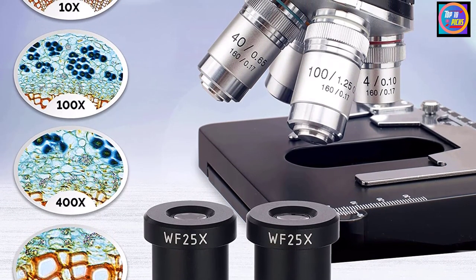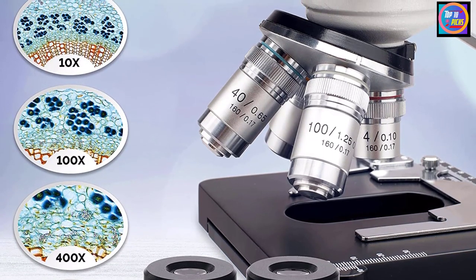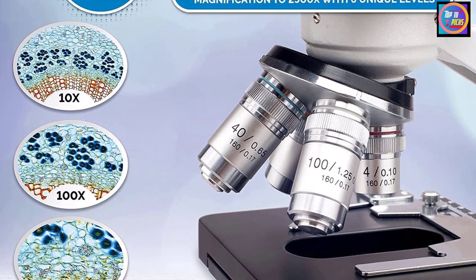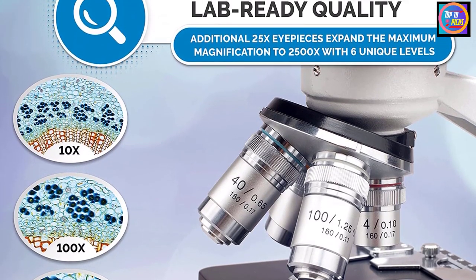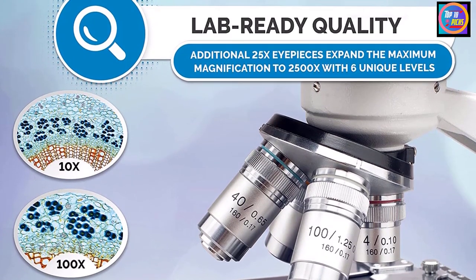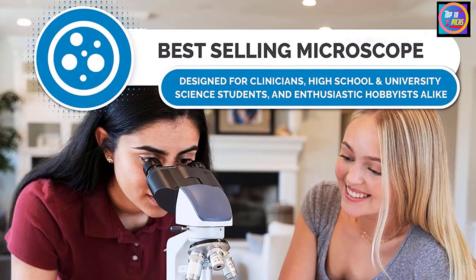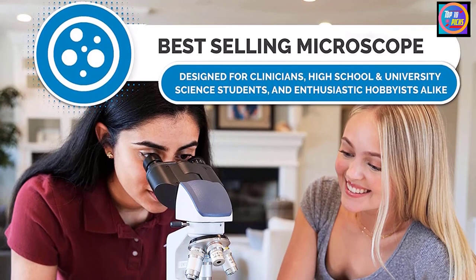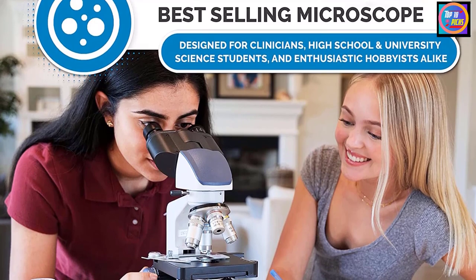Dioptric adjustment accommodates individual eye strength differences. The forward-facing nose piece has 4x, 10x, 40xs spring, and 100xs spring oil DIN achromatic objectives that combine with the eyepieces to provide color correction of magnified images at 5 magnifications. The 40xs objective is spring-loaded to prevent slide damage when focusing. The 100xs spring-loaded oil objective provides increased resolution over a standard objective.